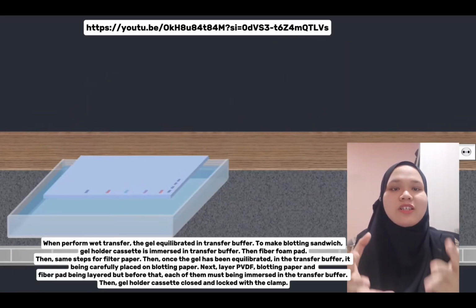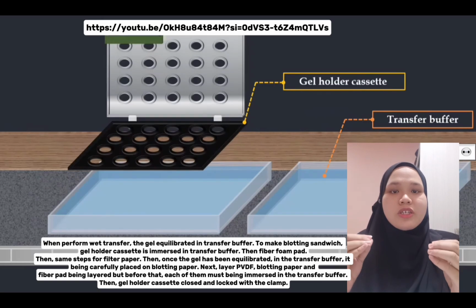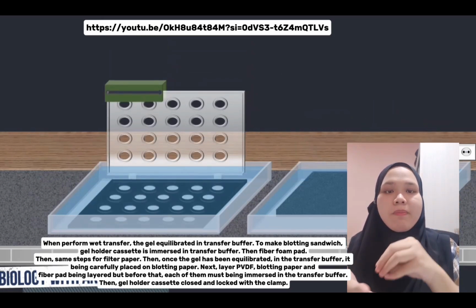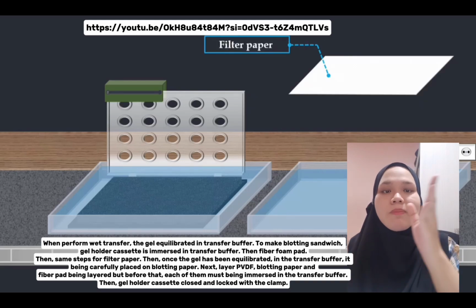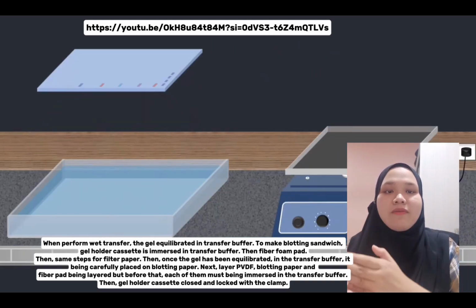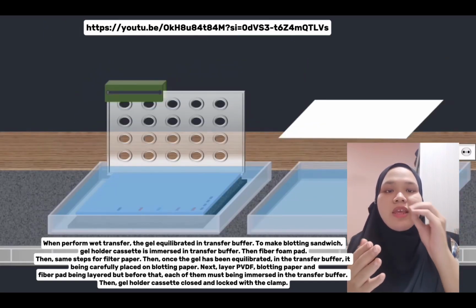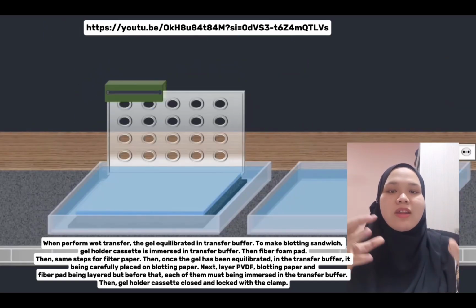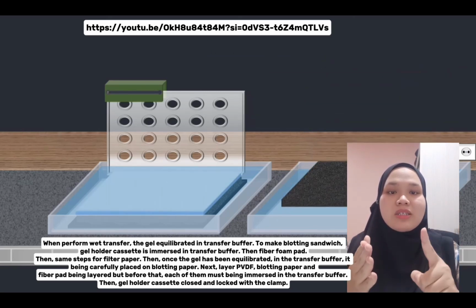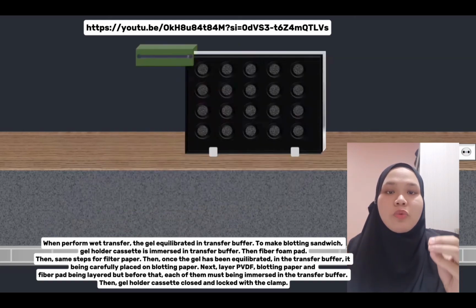When performing wet transfer, the gel is equilibrated in transfer buffer. To make the blotting sandwich, the gel holder cassette is immersed in transfer buffer, then the fiber foam pad, then the same steps for filter paper. Once the gel has been equilibrated in the transfer buffer, it is carefully placed on the blotting paper. Next, layer the PVDF, blotting paper, and finally the fiber pad, but before that, each of them must be immersed in the transfer buffer. Then, the gel holder cassette is closed and locked with the clamp.